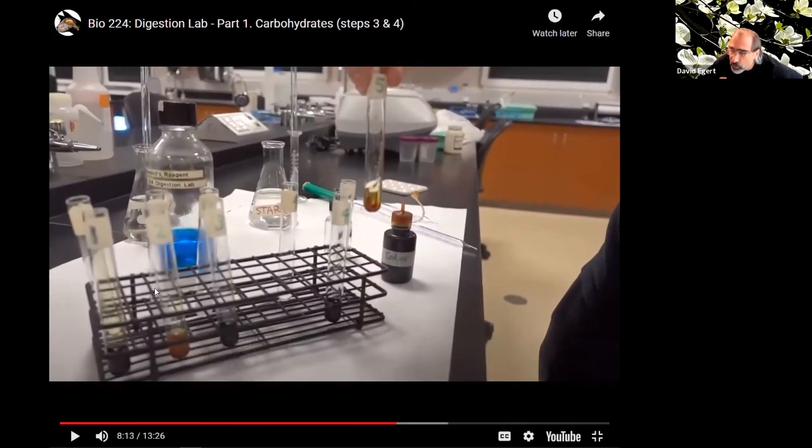All right, so this is important. This could show up on your lab exam, understanding what it looks like with the Lugol's test if there is starch or there is not starch. Here you can see when there is starch present, like in tube 1 and tube 3, which we were thinking was probably not going to break down, it turns this really dramatic purple black. That means yes, starch. If there is no starch, the iodine just stays kind of this yellow brownish color.